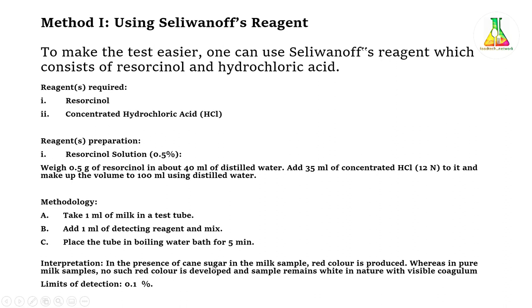For interpretation: if the milk is adulterated with cane sugar, you will see a brick red color appearance in the milk. This red color develops and indicates the presence of cane sugar. Now, every test has a limitation — if the concentration is below a certain level, the test will not be positive. The minimum concentration at which our test gives a positive result is called the limit of detection. For this cane sugar test, the limit of detection is 0.1%, meaning if 0.1% or more cane sugar is present, the test will be positive.